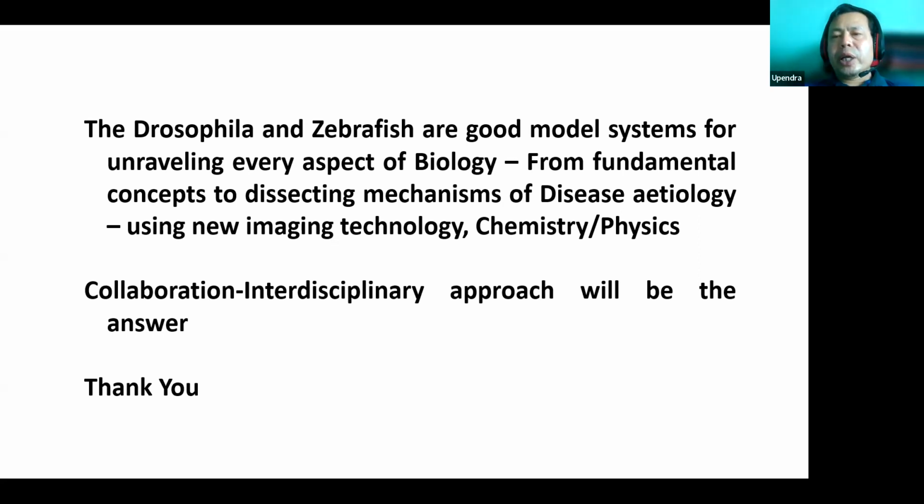James Spudich and Justin Molloy were the first to develop the optical tweezer. I think Partha must be knowing it. It was to track the single molecule within the cell. And I worked with Justin. I started my career with single molecules, how actin and myosin interact.